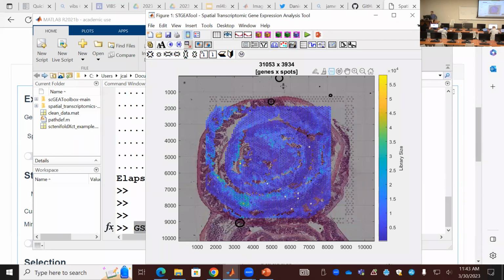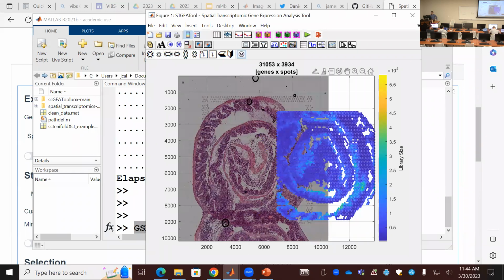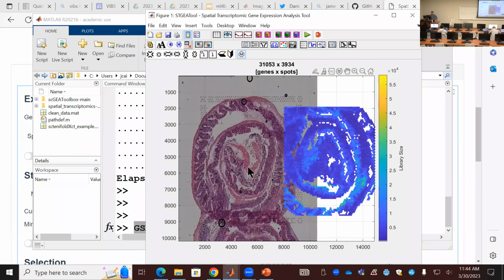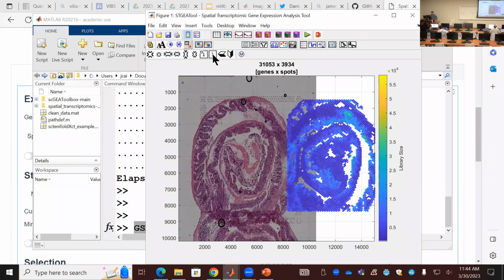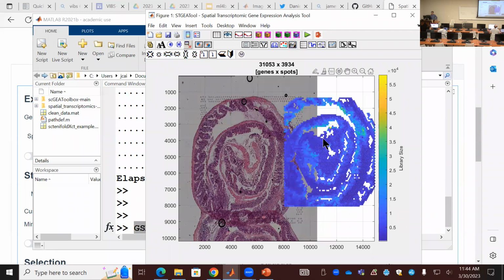So I make those spots smaller so I can see through, and then we'll do a rotation, see whether I need of this. Well, I think this spot here should match to here. So I'm going to rotate that again to align. This one, maybe I should flip it. Okay, so this looks like this.